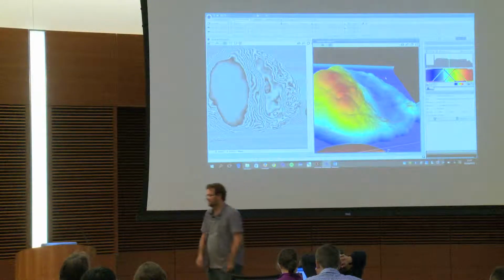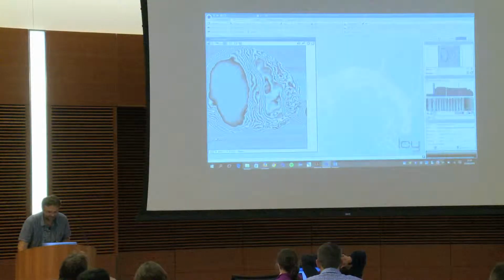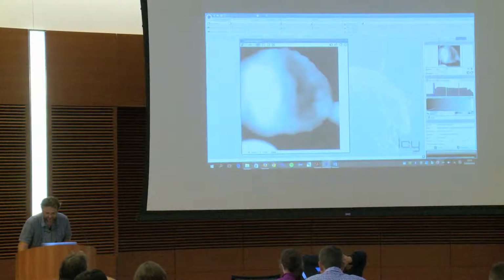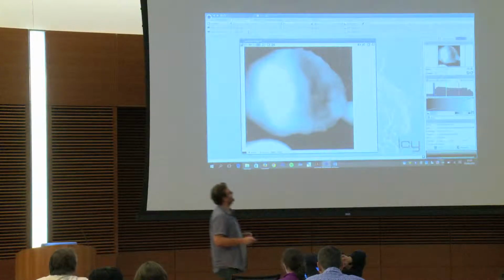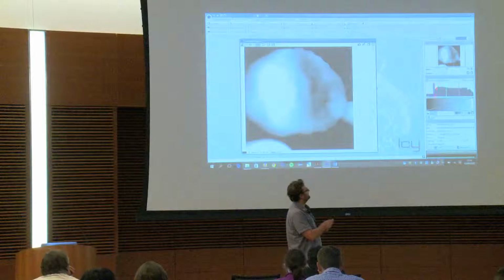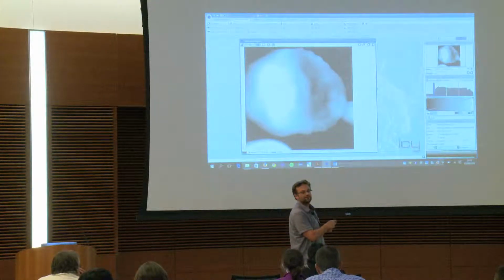Now, of course, we go back to 2D, sorry. So I close this, and here I go back to 2D, and I will put back the original thing that is here. So I have a question for you again. We saw that here we have all the data, and here it is the background. You agree? This peak was the background.